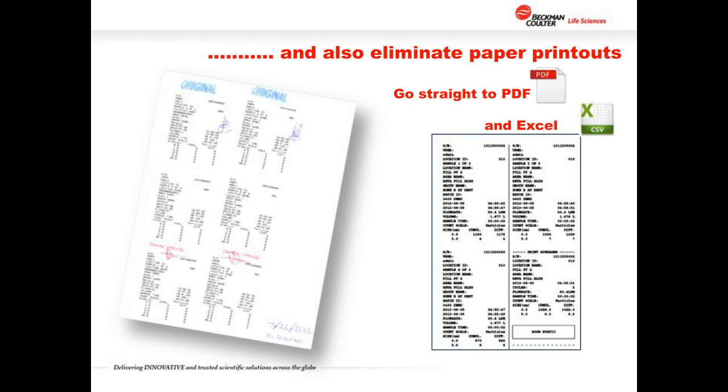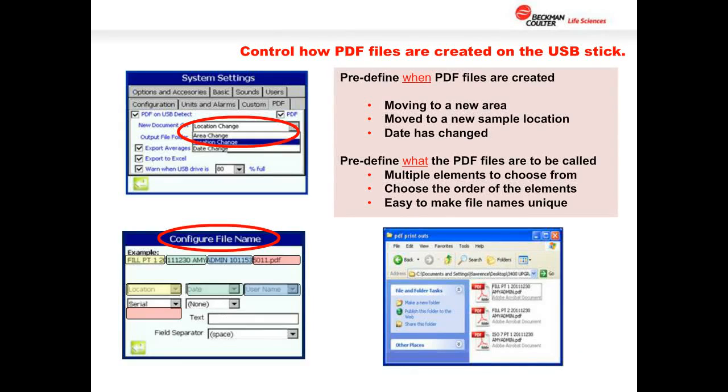That would certainly speed up the overall process. And that's possible today with some of the instruments that are on the market, like the Met One 3400, for example, which provides that kind of capability and the ability to set up files and structures that could flow directly into a LIMS system.